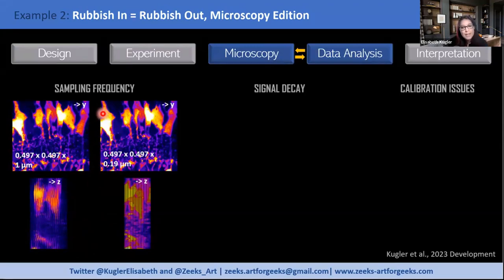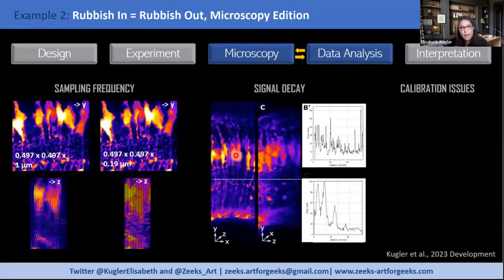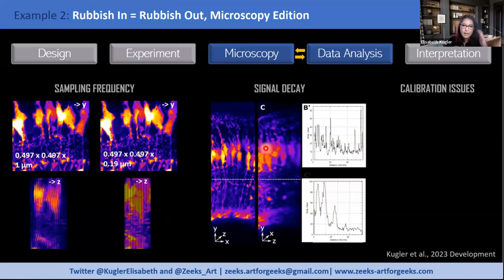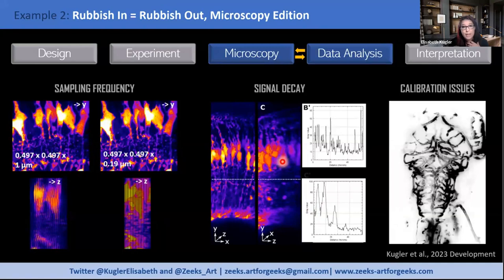The second problem is signal decay, especially common in confocal imaging where a focused laser hits the tissue. Looking at the z-axis side of the stack, the signal distribution in X-Y is very homogenous as expected. But as the laser penetrates deeper into the tissue, there is a huge decay of signal within just a few microns. When people assume they are quantifying the same thing at the surface as at depth, we need to caution them — it may not be the same thing at different tissue depths.